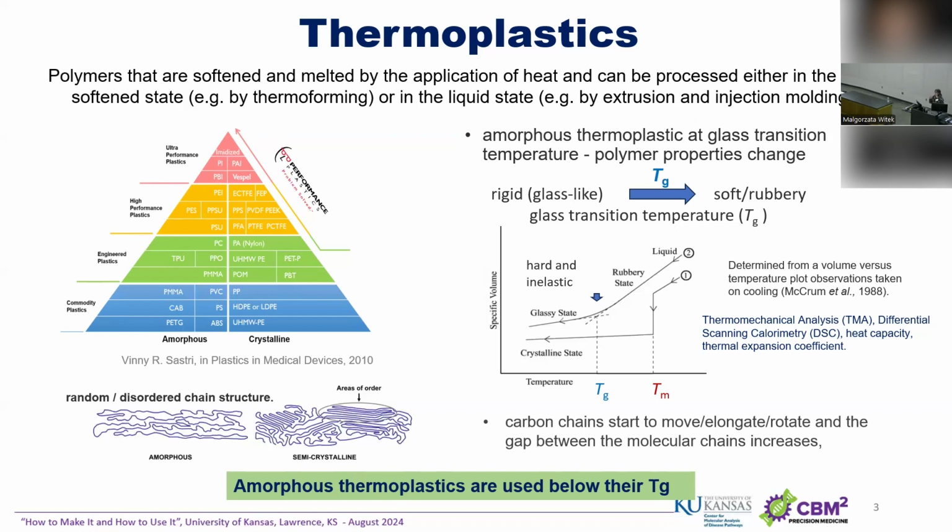So when you're designing certain thermal processes on your microfluidics, for example, a long time ago we started working with PCR amplification on the microfluidic chip. You need to be wary of your 95-degree step in the amplification and match the thermoplastic material.